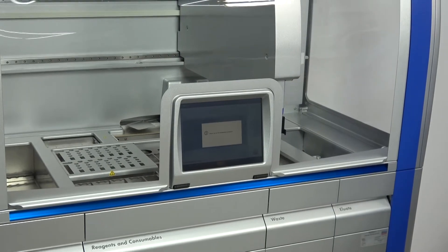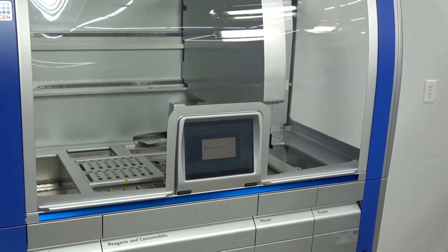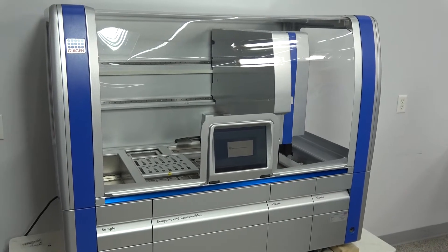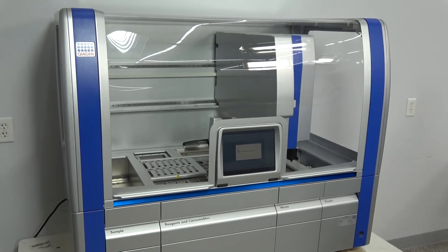The Kaia Symphony purifies viral RNA and DNA, cellular RNA, genomic DNA, or proteins from 1 up to 96 samples.